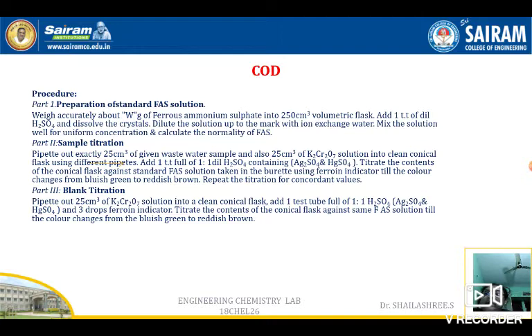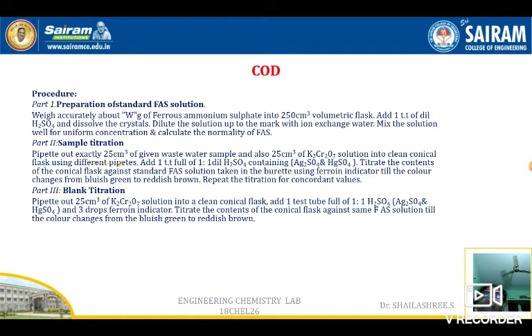Coming to the experimental part, we have to first prepare a standard solution — standard FAS solution — for our burette. The standard solution used is ferrous ammonium sulfate. Wash all the apparatus cleanly with distilled water. Add the given ferrous ammonium sulfate crystals to a cleanly washed 250 ml volumetric flask. Importantly, you are adding one test tube of dilute H2SO4.